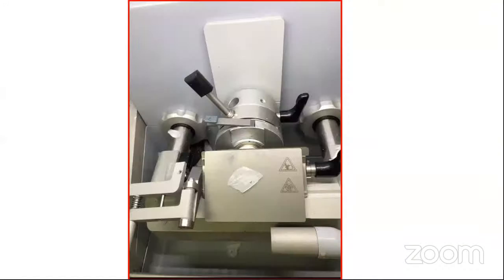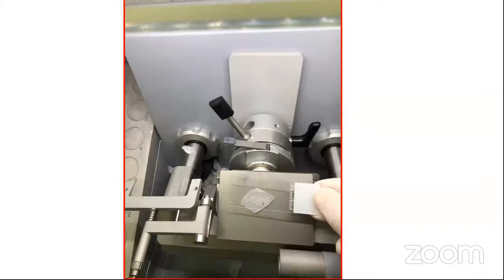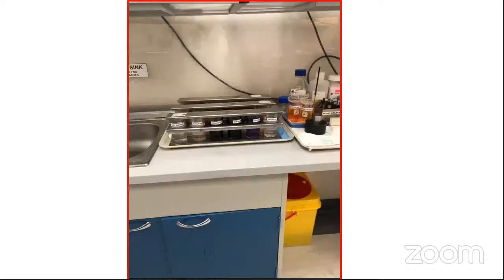Finally, we got a nice, thin, intact section. It is about 5 microns thick. We pick it up with a glass slide. We place it in alcohol, then we stain it with H&E, hematoxylin and eosin.